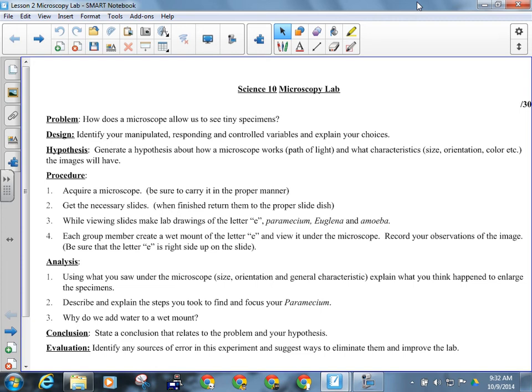Bacteria are prokaryotic cells. They don't have those structures. They're still cells, but they don't have the internal structures. So these are eukaryotic cells. In terms of a single-celled organism, they're all quite large, and that will enable us to get some practice using the microscope and figuring out how it focuses best and things like that. So basically just to practice with.